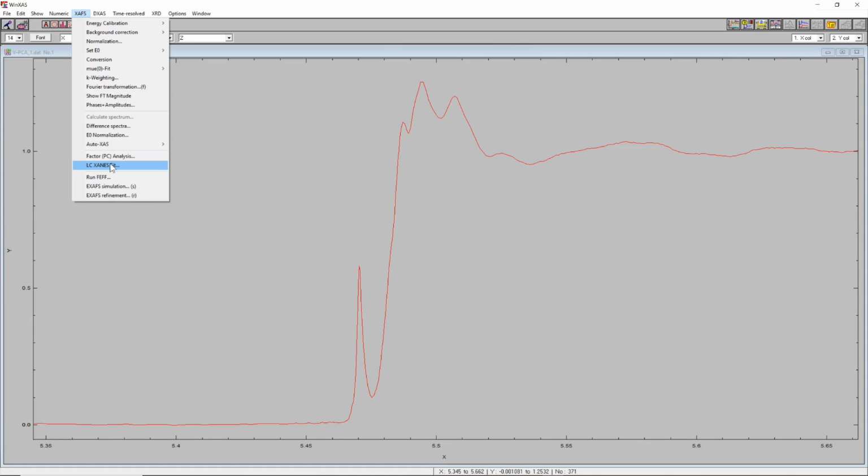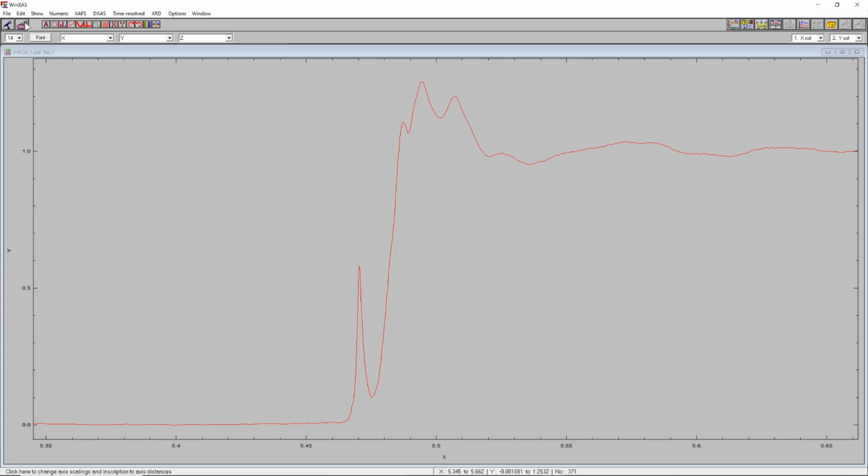So instead of applying the macro that we saved earlier to every single individual spectrum in the series, we want to use a batch analysis. We have a multiple column file, and the reason why I actually generated this multiple column file is that it permits this type of batch analysis.